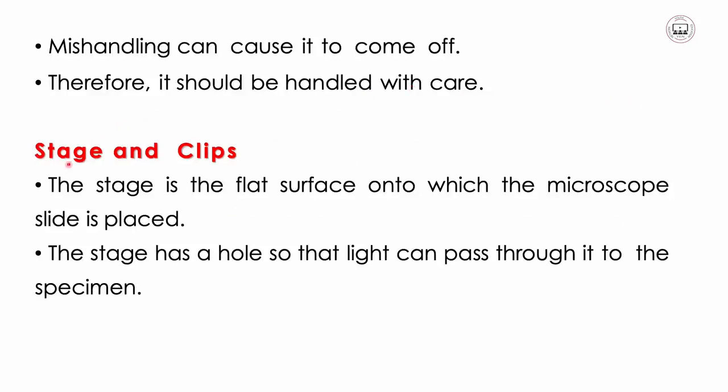Now let us look at the stage and the clips. The stage is the flat surface onto which the slide is placed, and the stage has a hole so that light can pass through it to the specimen.